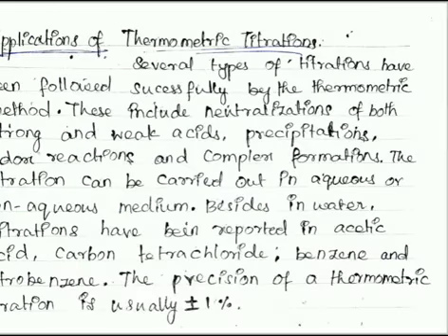We have some more applications of thermometric analysis. They include the neutralization of both strong and weak acids, precipitation reactions, that is acid-base titrations, precipitation titrations, redox titrations, and complex formation titrations, that is complexometric titrations.